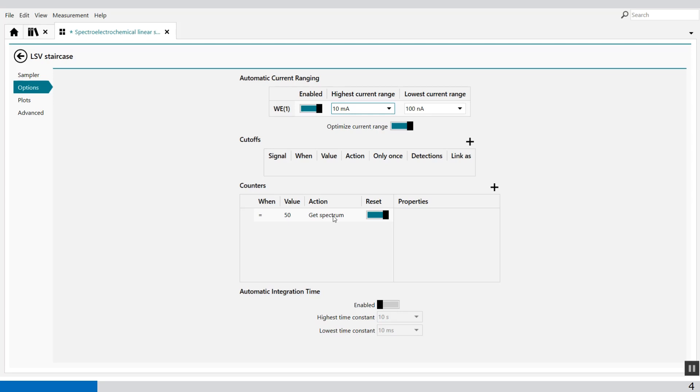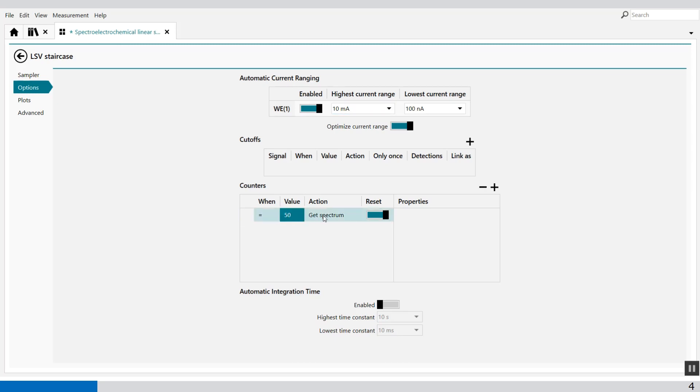Since the counters are intrinsically linked to the measured data, the events triggered by the counters are directly correlated by the data points. So which means that every 50th data point we're going to take a spectrum.